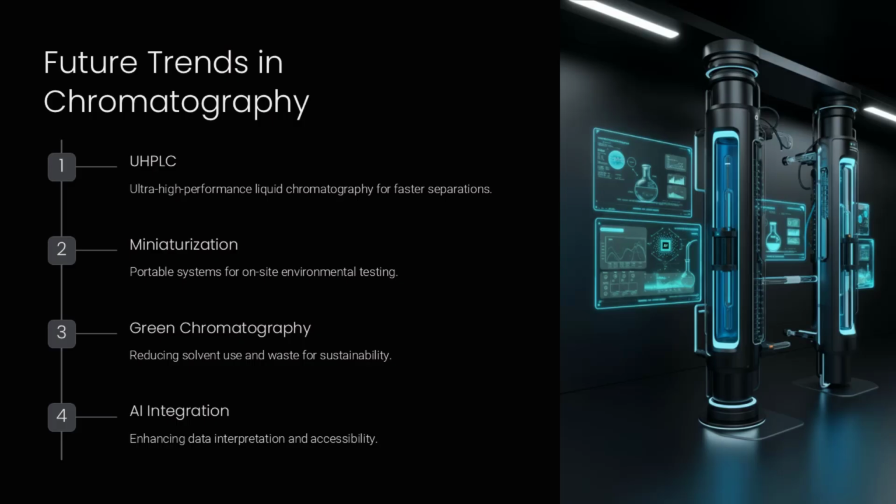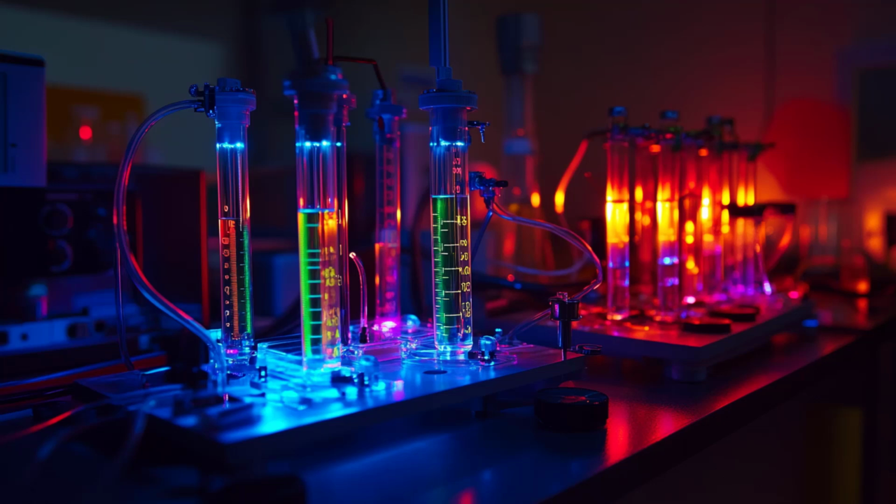The future of chromatography focuses on increasing efficiency, sensitivity, and environmental sustainability. Ultra-high-performance liquid chromatography, UHPLC, improves separation speed and resolution. Advances in miniaturized and portable systems allow for field-based applications, such as on-site environmental testing. Green chromatography emphasizes reducing solvent use and waste, aligning with global sustainability goals.